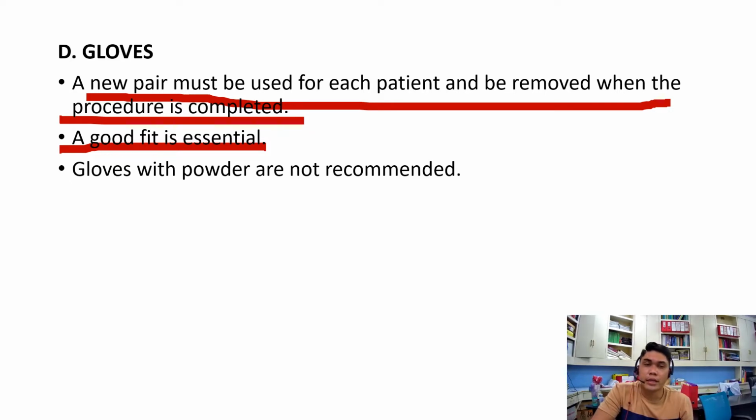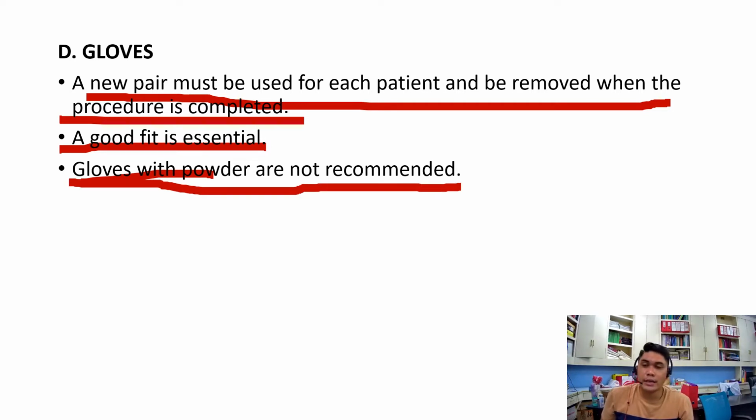And with gloves, there are gloves with powder, and gloves with powder are not recommended because the powder, for example, latex, usually causes contamination to your specimen. And another thing is there are individuals who are sensitive to latex. So that's why for gloves we usually use nitrile gloves.